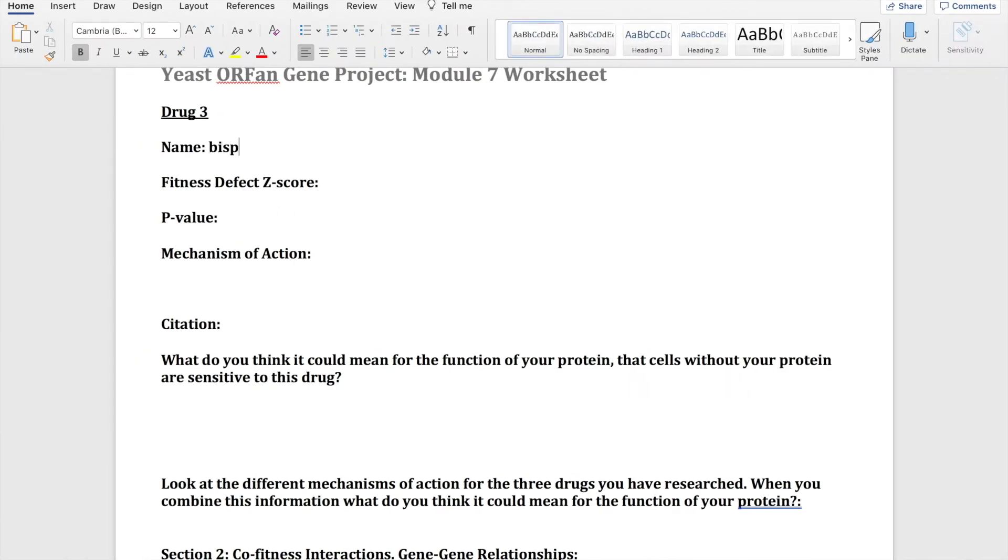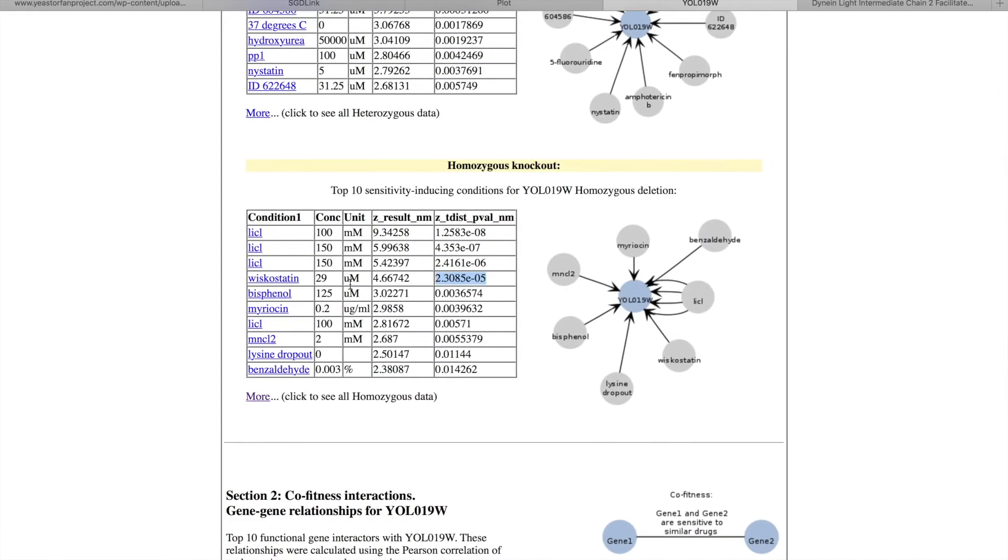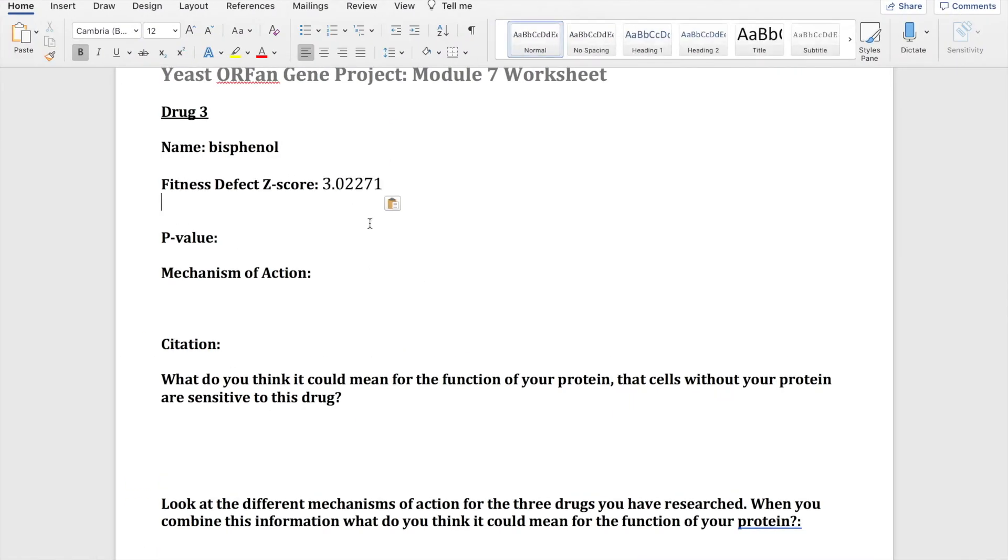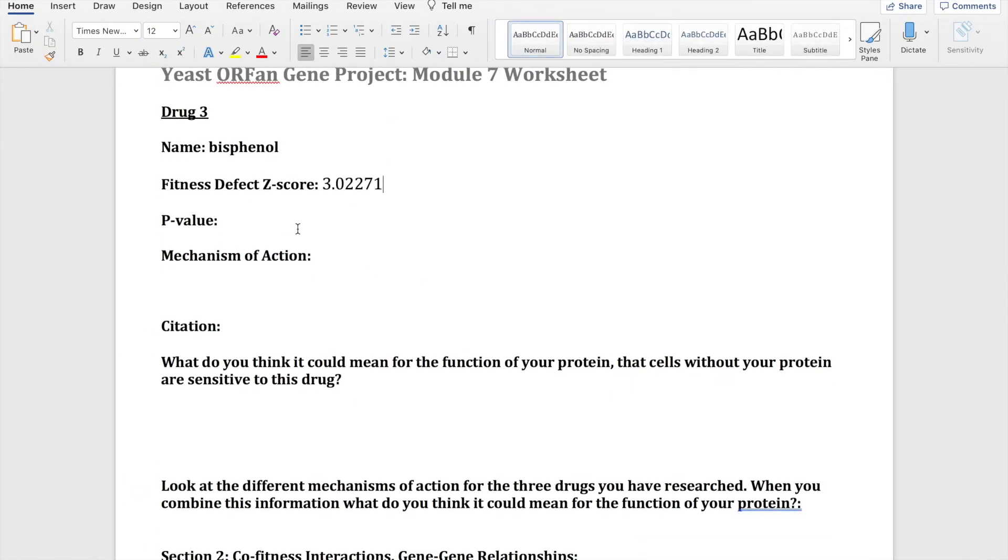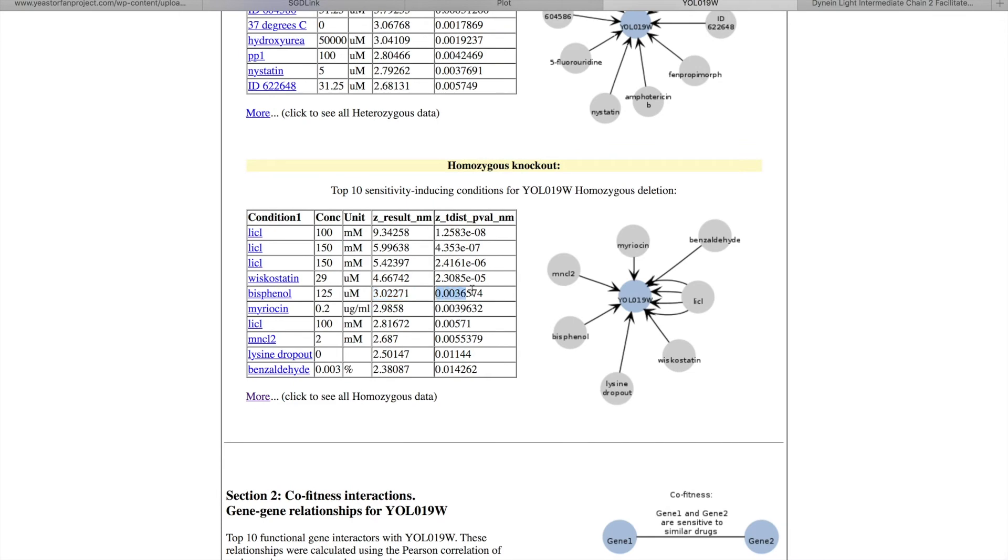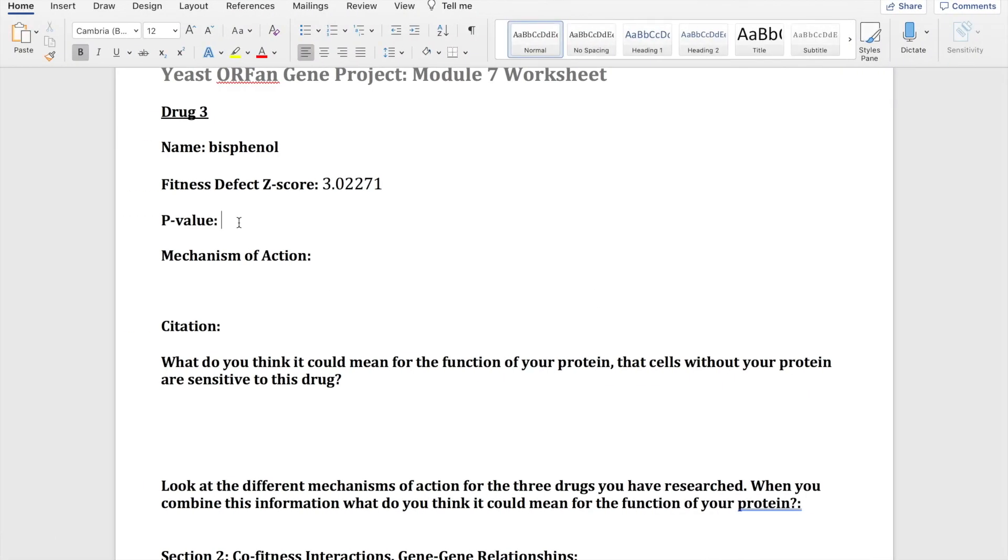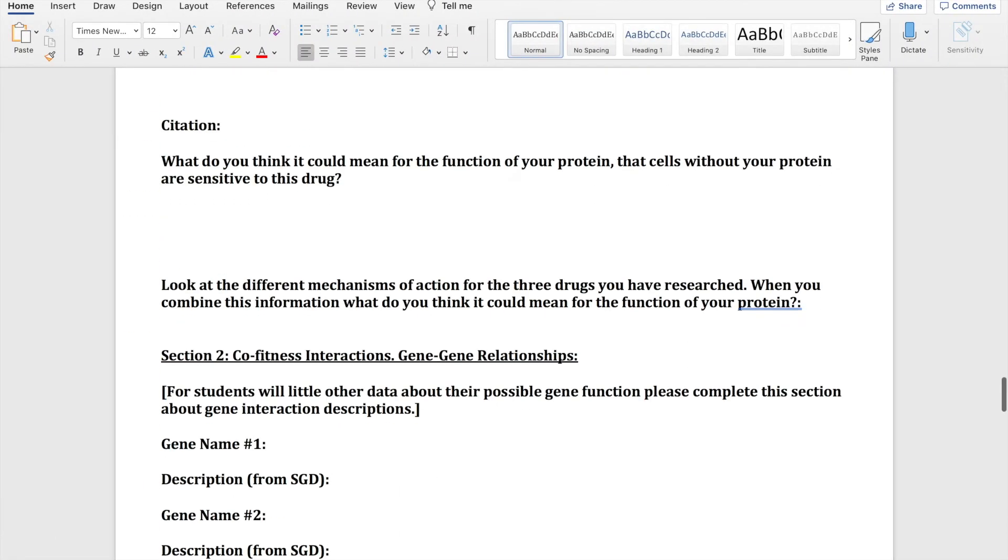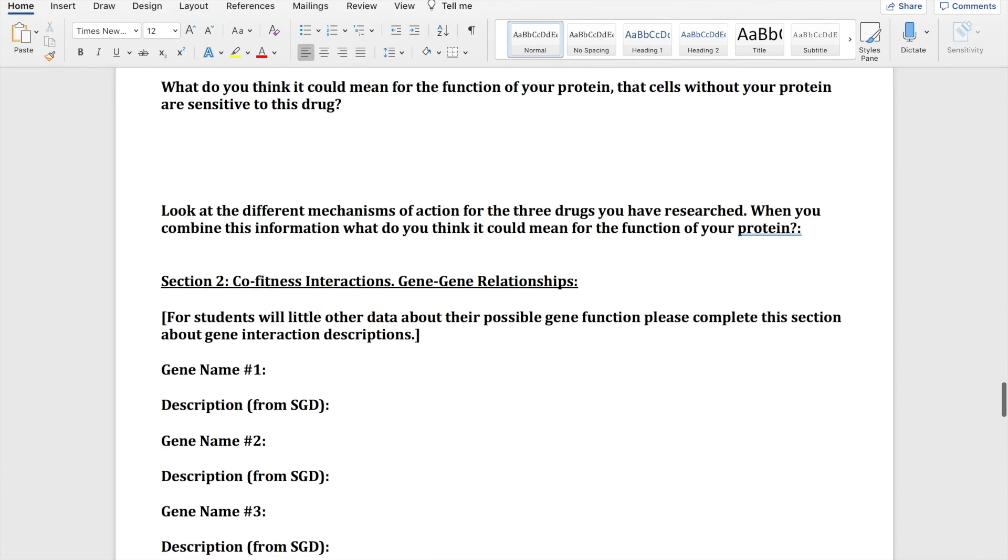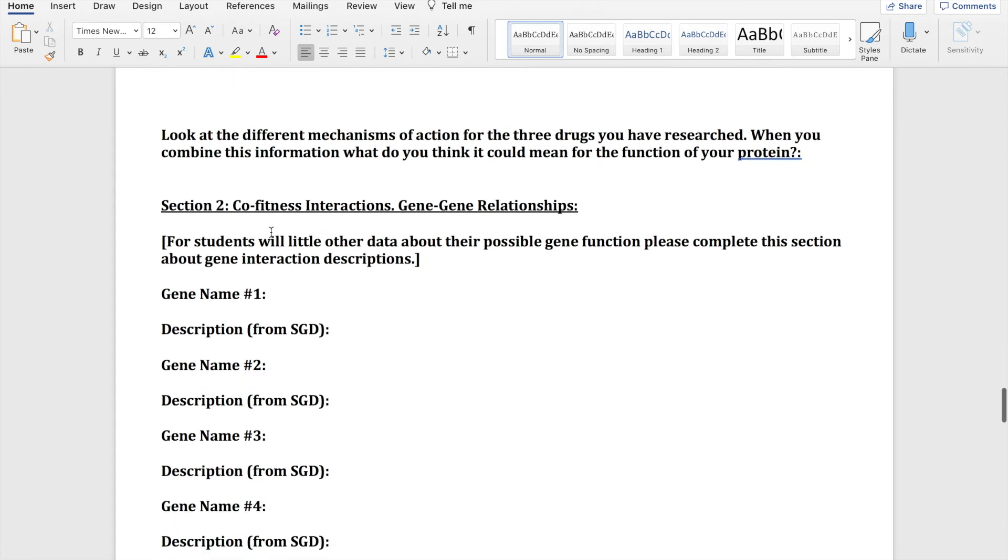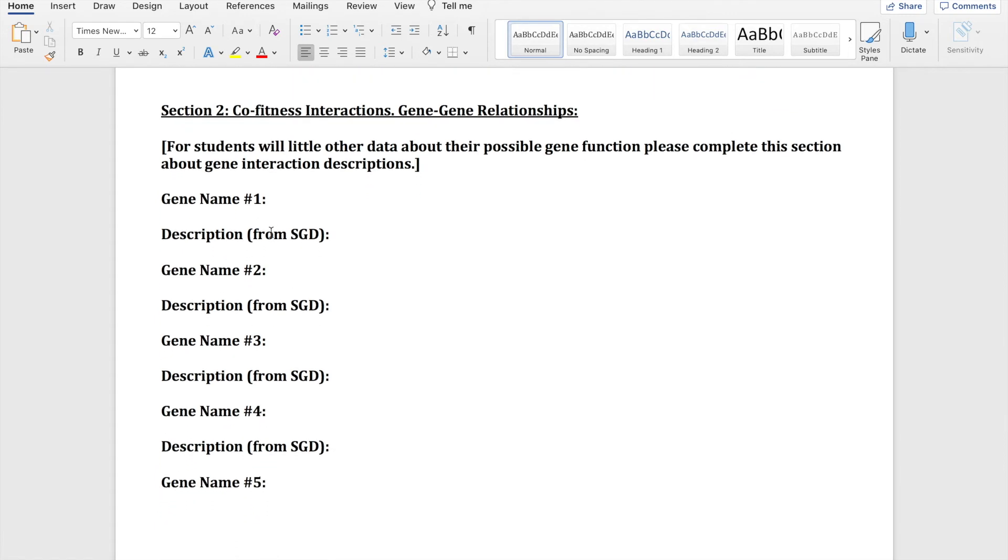So bisphenol is this drug that comes up, copying the z-value again, copying the p-value. And again you would want to get the mechanism of action. And then at the end it asks to look at the different mechanisms of action for the three drugs you have researched. When you combine this information, what do you think it could mean for the function of your protein? So anything that shows up that could show a similar function you would want to talk about.